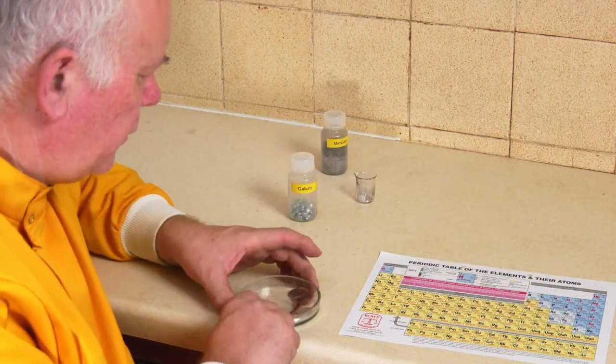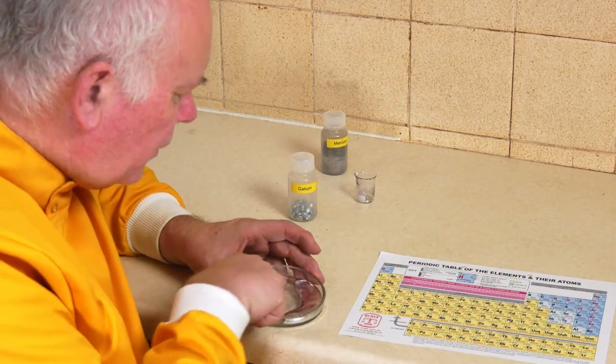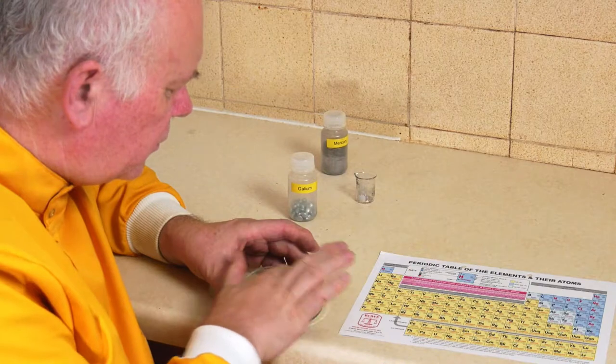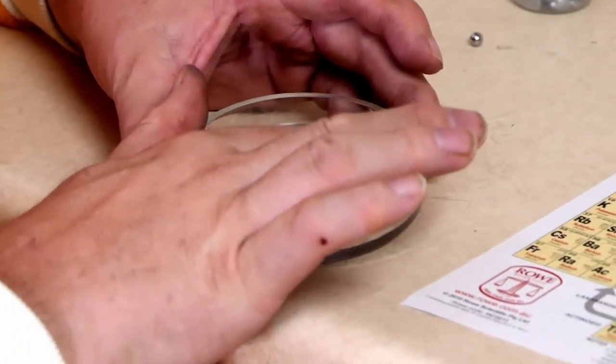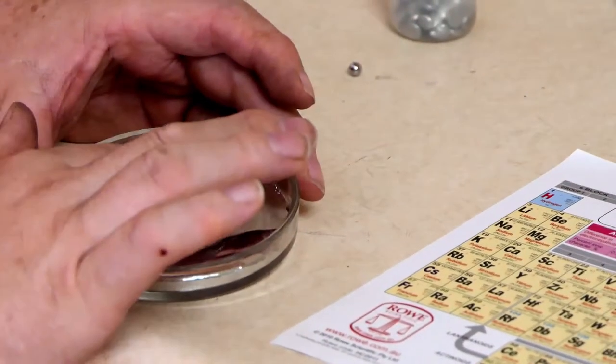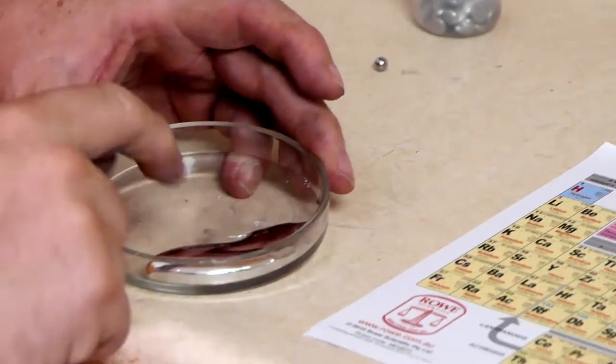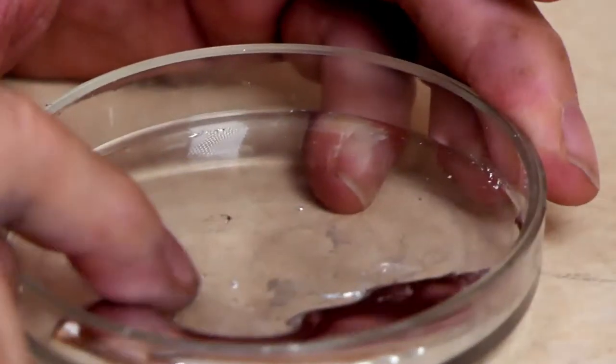So let's have a look at this gallium, see what it's like. Well, it sort of sticks a bit to the glass. It's got a sort of film on the surface. It can make my finger go a little bit black. It's not toxic unlike mercury.